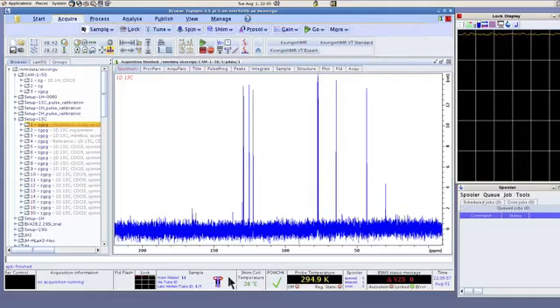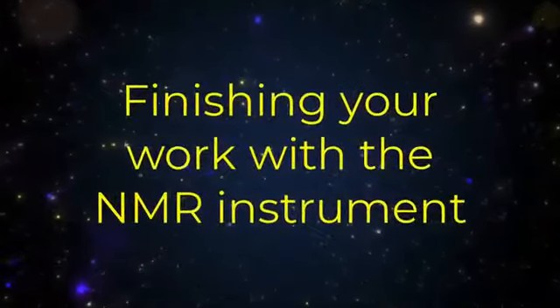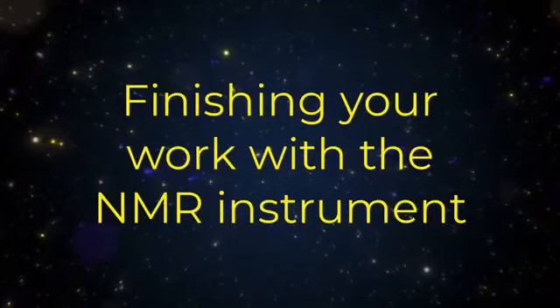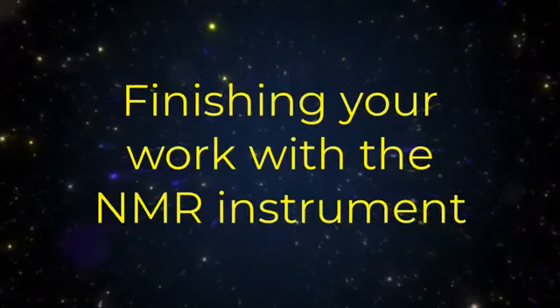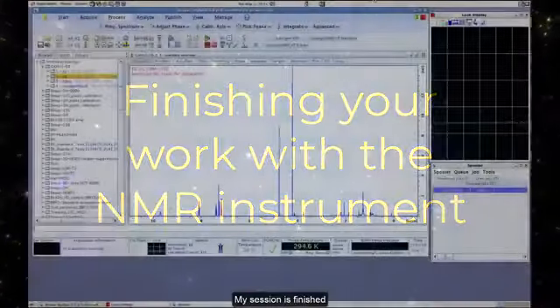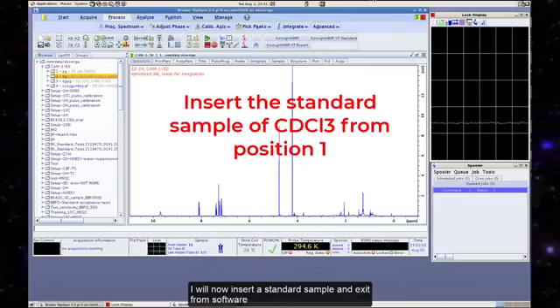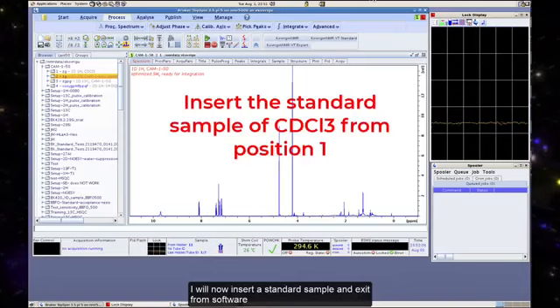This is highly reproducible and minimizes user error. 4.5 Changing and handling NMR tubes to prevent probe damage. A broken NMR tube inside the probe is a catastrophic and extremely expensive event that requires a service engineer to disassemble the probe. NMR tube quality: always use high quality, straight tubes. Inspect them for cracks or chips before use.